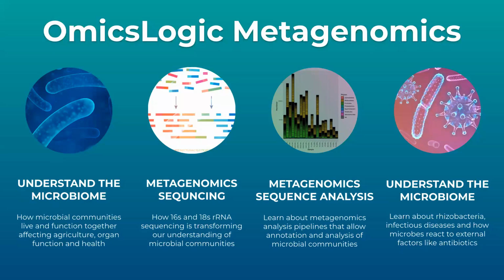But we'll also move on forward from there and start talking about some of the analysis methods. So how do we analyze different types of next generation sequencing data? That type of analysis could be applied to different types of applications. Detection of some microbes in samples by separating the host and the pathogen, and then looking in a variety of databases to spot which pathogens are present.